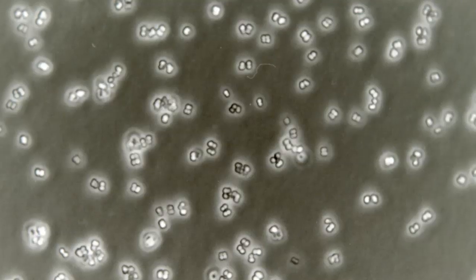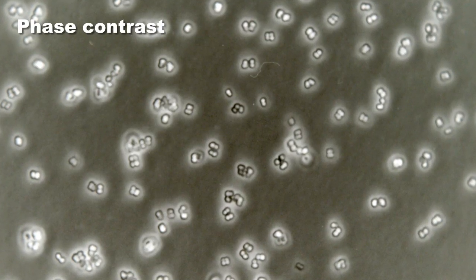And if you have phase contrast optics, then these optics will convert differences in refractive index, because the bacteria, even though they're transparent, they have a different refractive index than the surrounding water. These optics will convert a different refractive index into differences in brightness. So this is a really cool method. And I'm going to just show you now a few pictures that I've taken several years ago, using my university's phase contrast microscope.